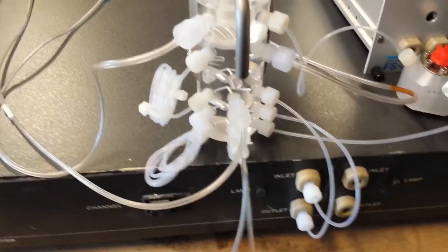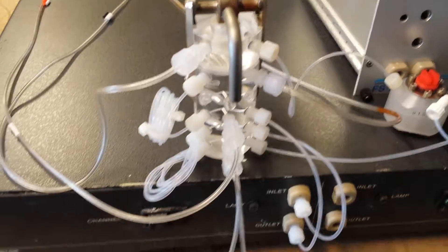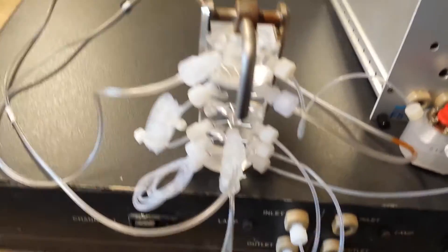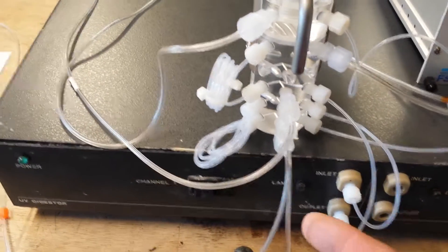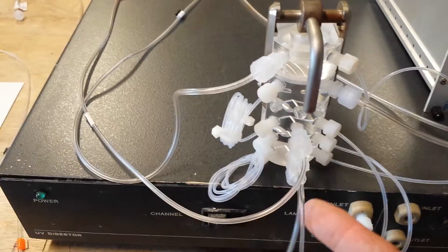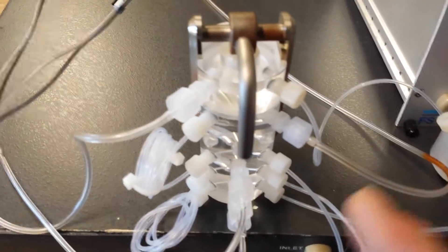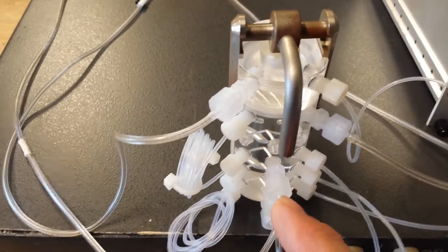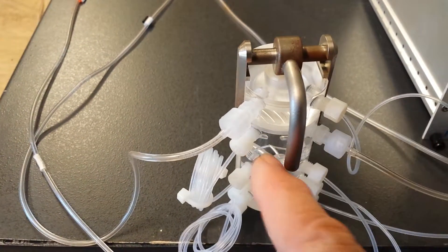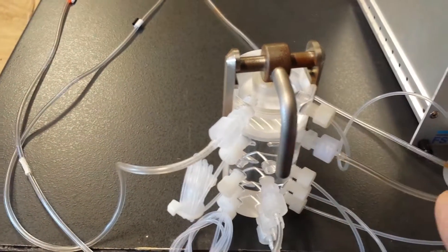We find there is a simple way to do that. You see here you've got the two lines going down to the UV module after they've gotten the TA1, and then just the small orange-blue airline. Then it comes back, gets the TA2, mixes in the mixing coil, passes under the membrane, and goes to waste.